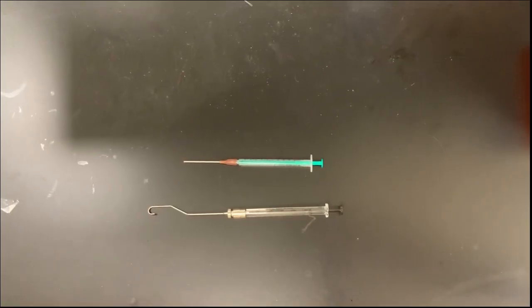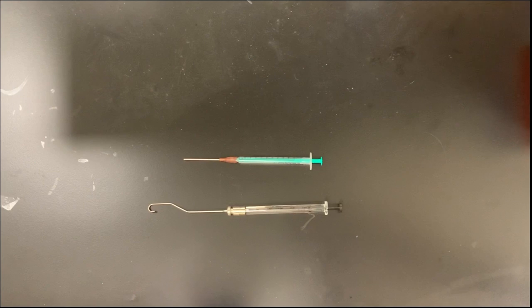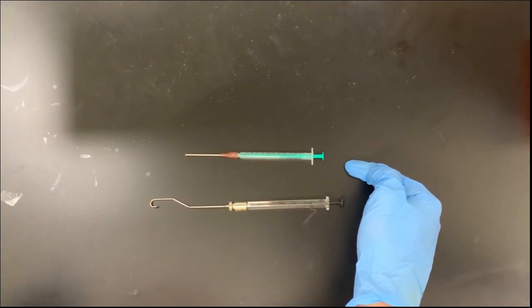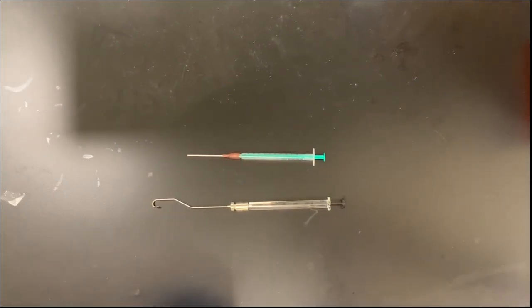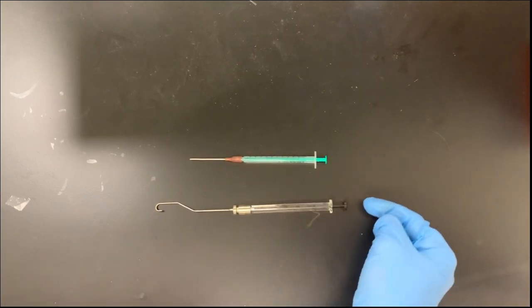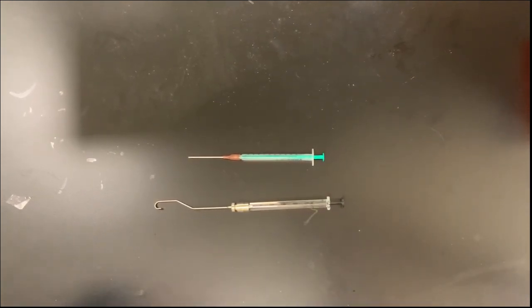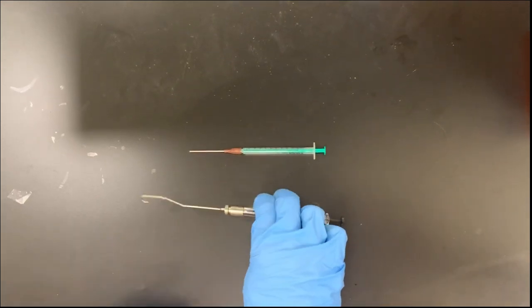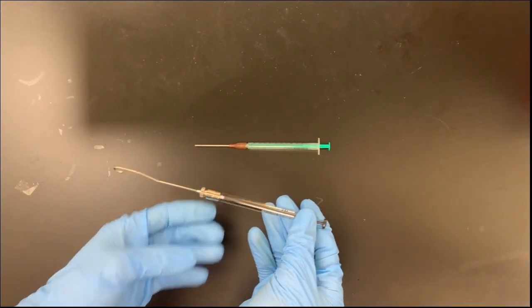First, find which syringe and needle you'll need for your measurement. If the droplet is denser than your continuous phase, you'll need a straight pendant drop needle, since the droplet will sink. If the droplet is less dense than your continuous phase and will float, you will need an inverted pendant drop needle. Today, we will measure toluene dropped in water, so we will need to use an inverted pendant drop needle with the glass airtight syringe.